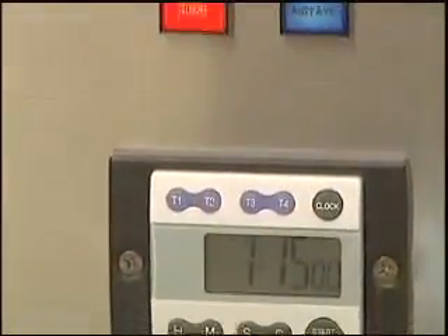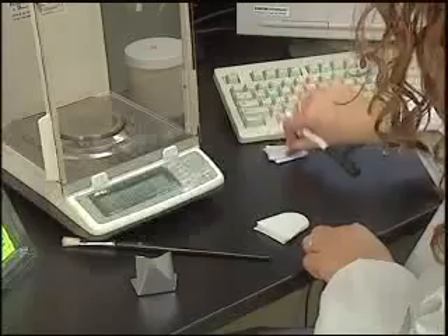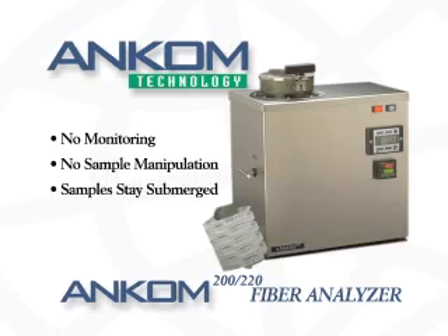At this point, the user is free to do other work or enjoy a lunch break. With most methods for fiber determinations, a technician has to monitor the process and periodically rinse or move sample back into the heated solution to ensure complete solubilization. With ANCOM filter bag technology, the sample is always submerged in solution with constant agitation.